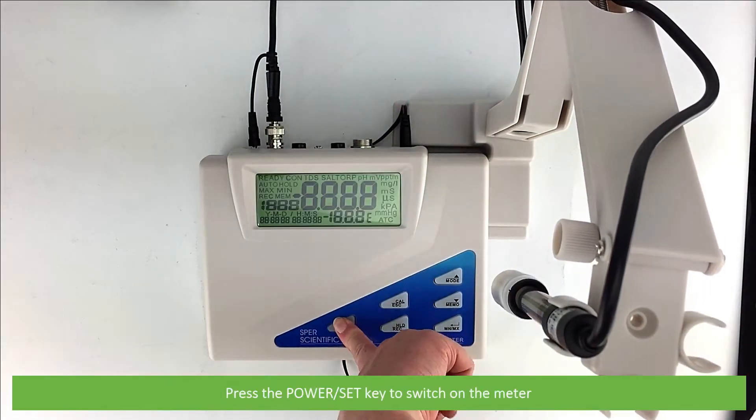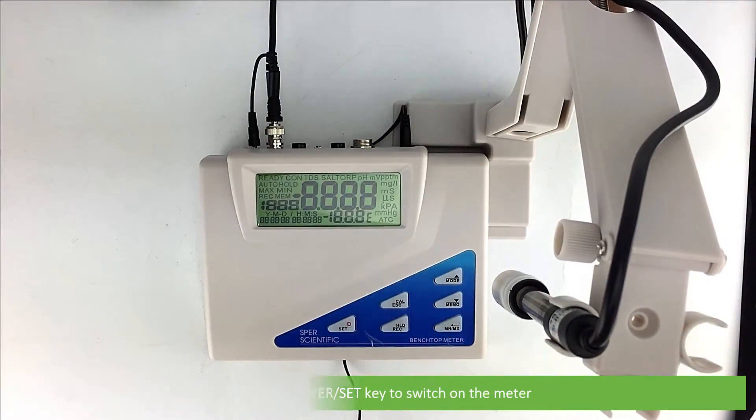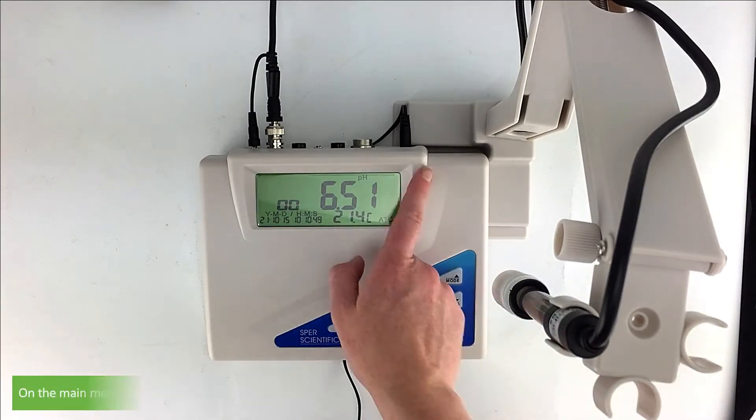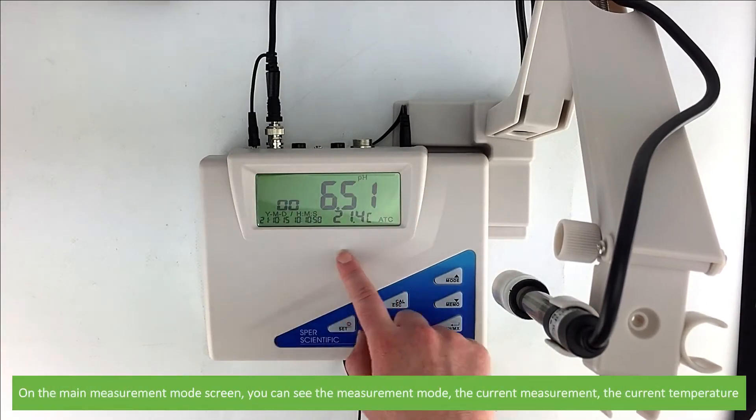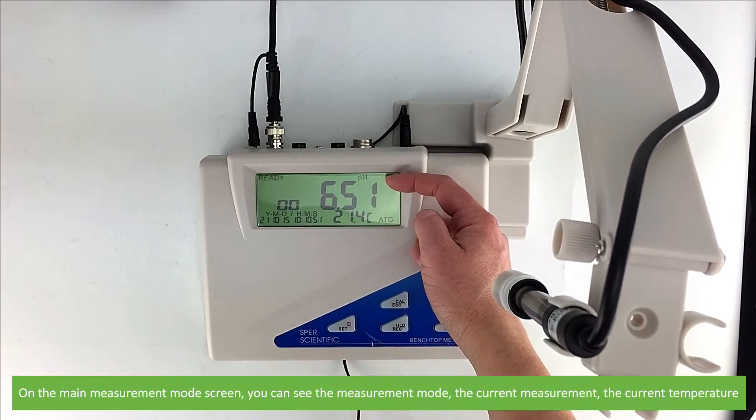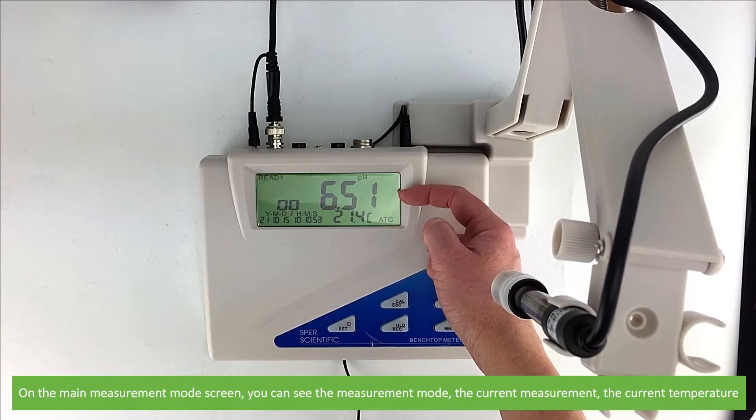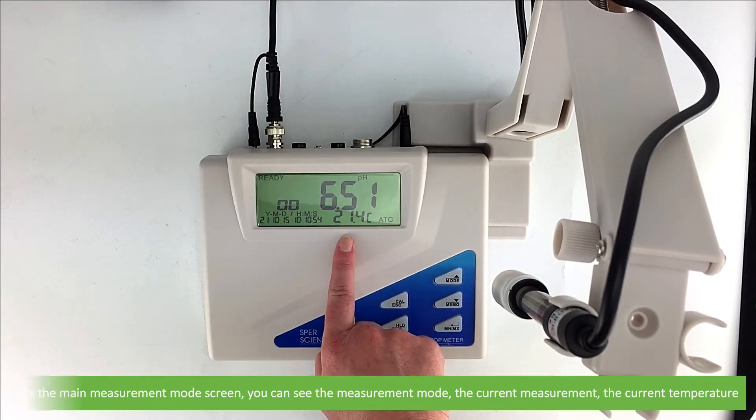Press the power set key to switch on the meter. The device will switch on and be in measurement mode. On the main measurement mode screen you can see the measurement mode, the current measurement, and the current temperature.